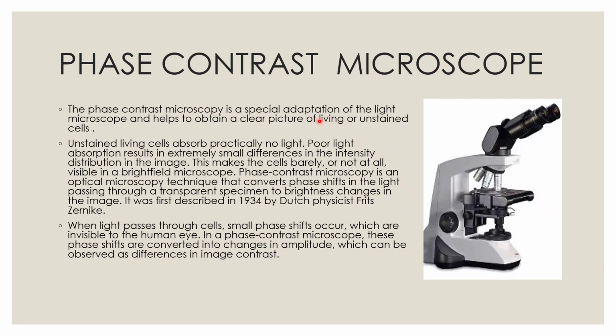Compared to the dark field microscope, the phase contrast microscope gives you much better contrast and a much clearer picture. Mainly, the phase contrast microscope works on a technique that converts phase shifts in the light passing through a transparent specimen into brightness changes.